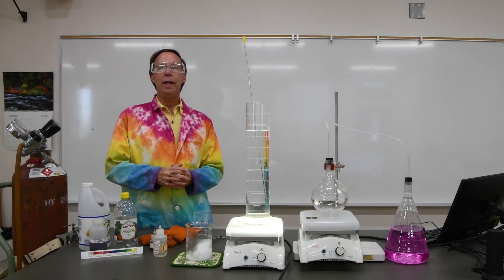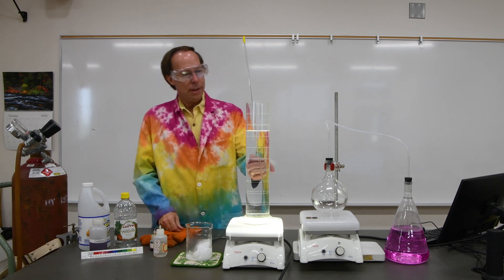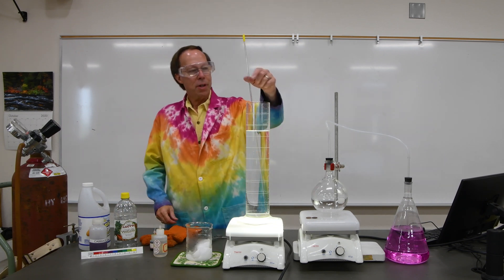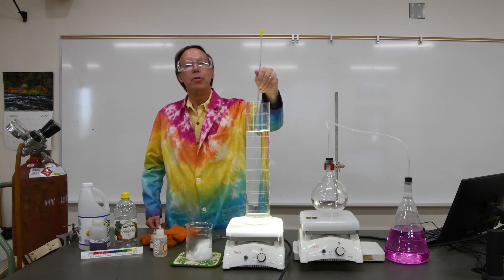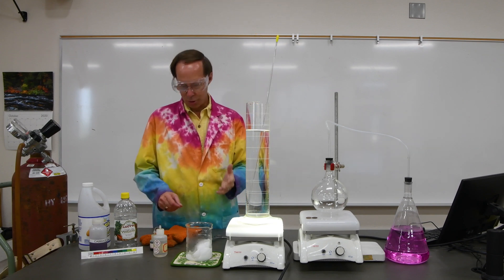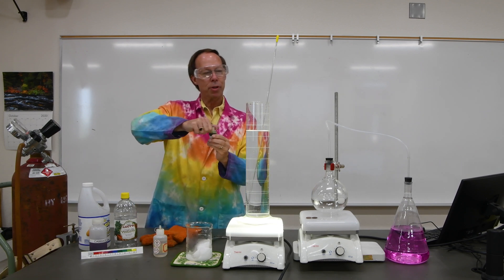Let's go ahead and do an experiment using Universal Indicator. In this graduated cylinder I've got deionized water and I've added a little bit of sodium hydroxide just to make it basic to start with. So let's go ahead and add some of our Universal Indicator.